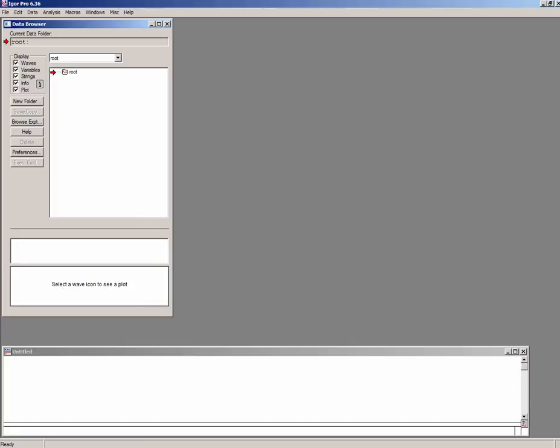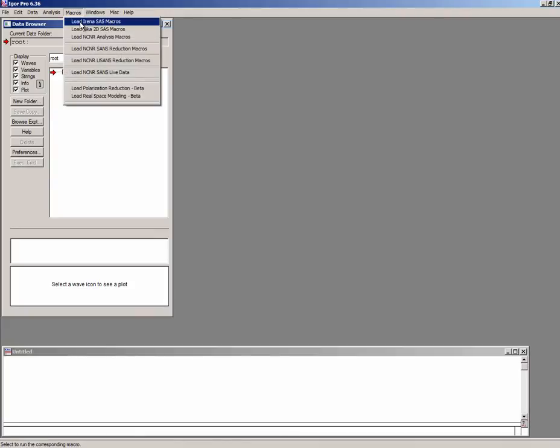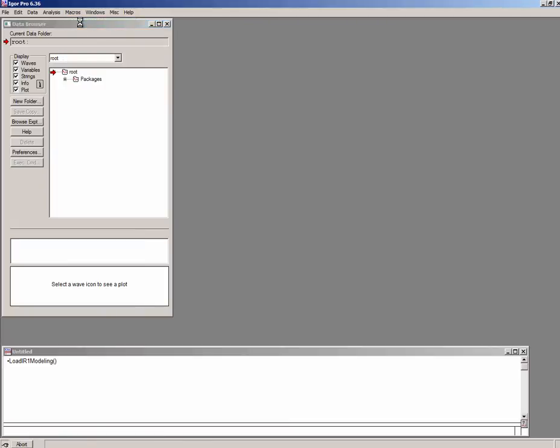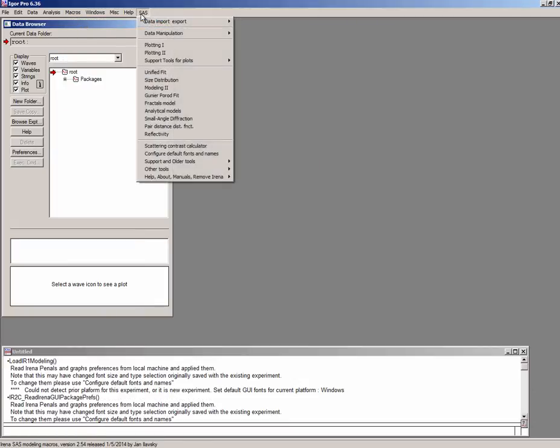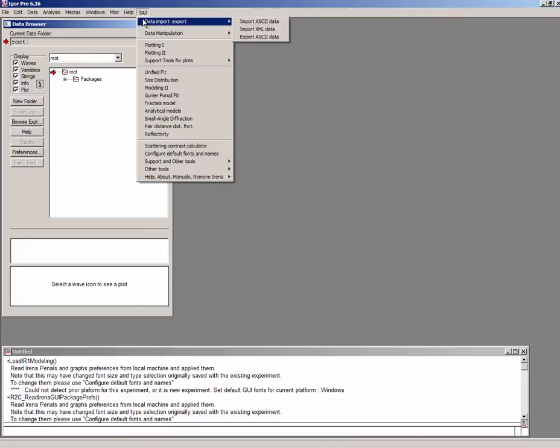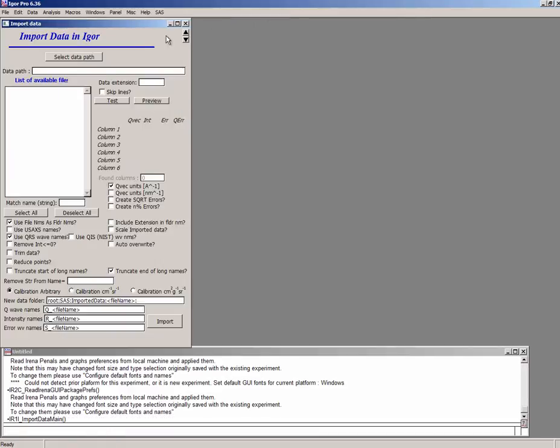First thing is what I have here is an Igor Pro, the current version is 6.36 and I have installed in there IRENA macros. So I'm going to start IRENA macros and I need to import the data from an ASCII file because the file is available to me as ASCII. So I'm going to pick an ASCII import tool and here is the main GUI for it.